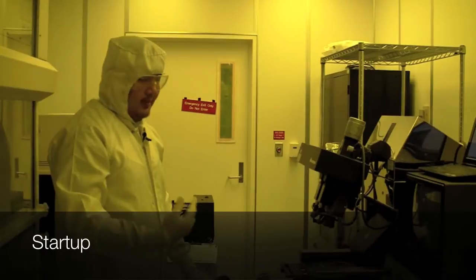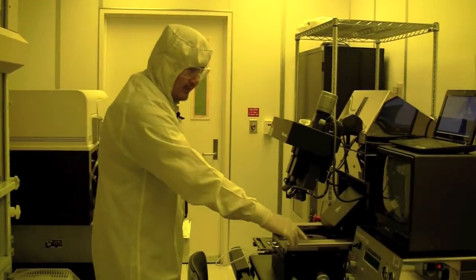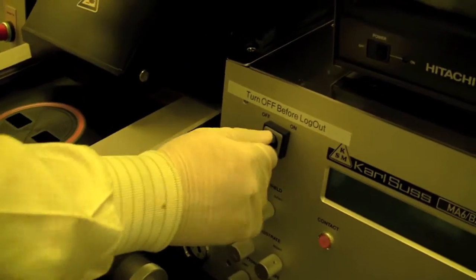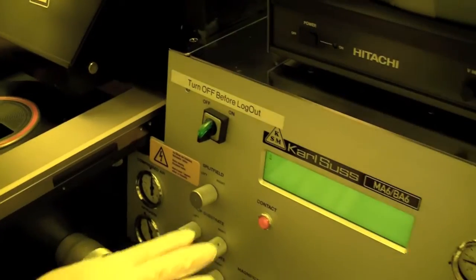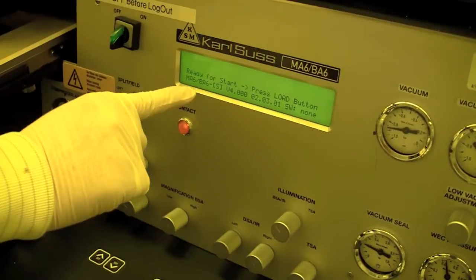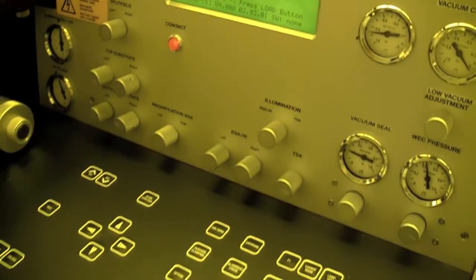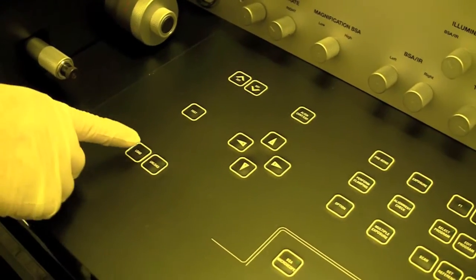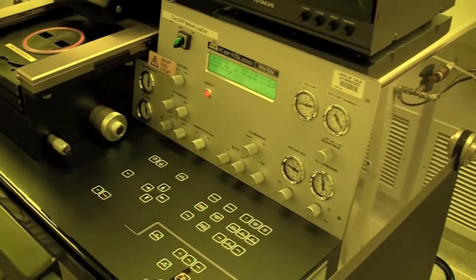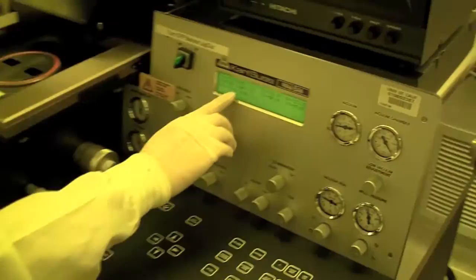Once you've logged in, the machine will be able to power up. We turn the on switch on here. You can see the machine starting up, and it's important to read the screen — it tells you a lot of information. It says 'ready for start, press load button.' The load button is right here, and we press that. Now it says 'watch out, machine is starting up.' When the machine is ready for load and started up, the information says 'ready for load.'